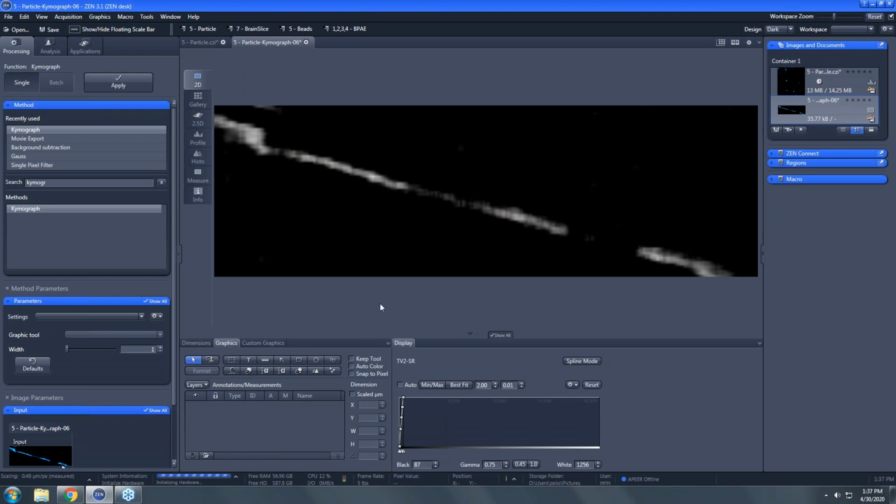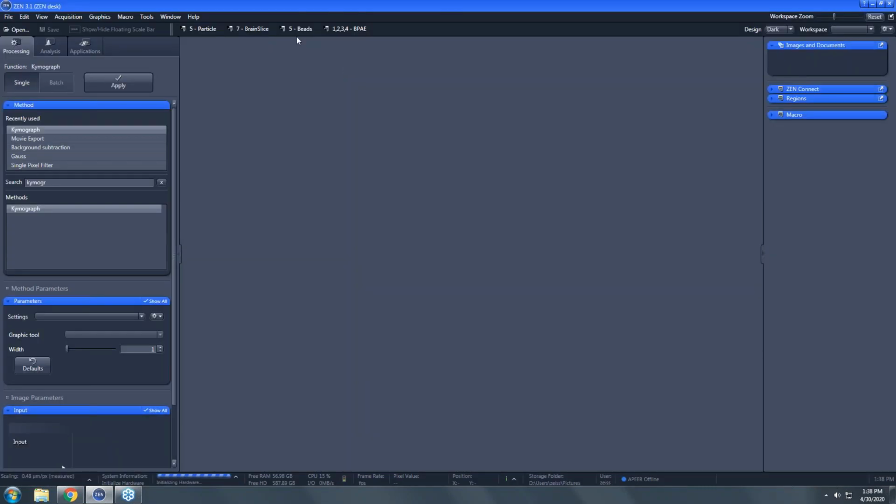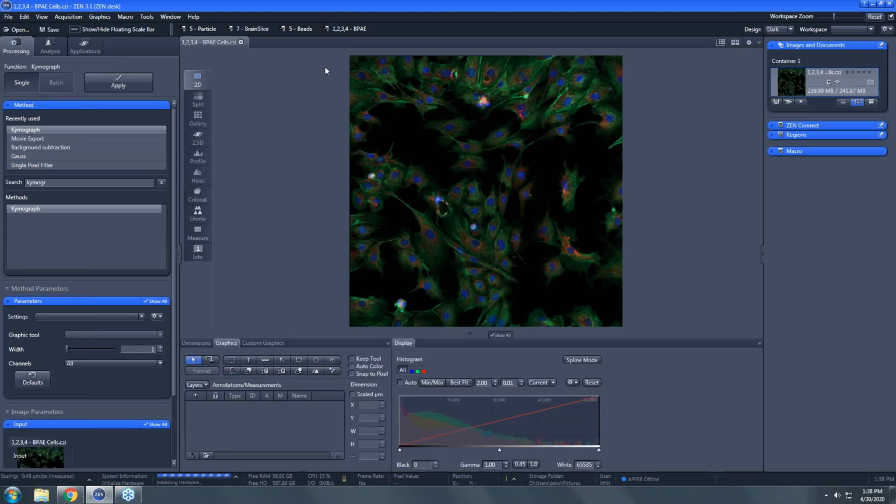Very good. So let's do now some more intensity measurements. Let's go back to our BPAE slide, if we could, Nicole. I suppose we could have reordered these and then we would have been more efficient with the opening and closing of the images, but that's just occurring to me now after running through this multiple times. Okay, so the BPAE image, and let's crop out a smaller region of this just to make the display more manageable. We could zoom in, whatever, doesn't really matter.